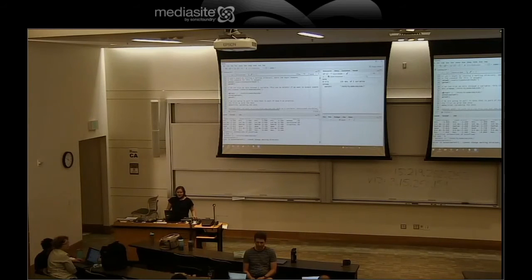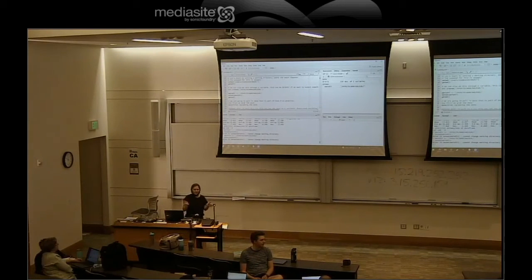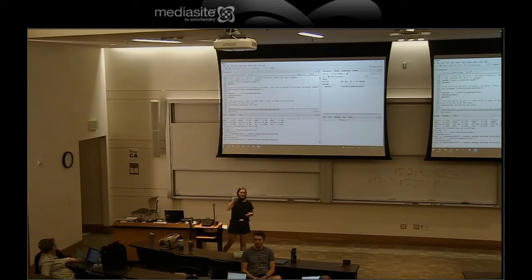The other thing is when you're running a line in R, you don't need to highlight or go to the beginning or end of any line. You can just hit run and it'll run that line. Hit run again, it'll run the next line. You don't have to highlight or do anything crazy. You also can't really run multiple lines at once right now. Just keep hitting run for each individual line.